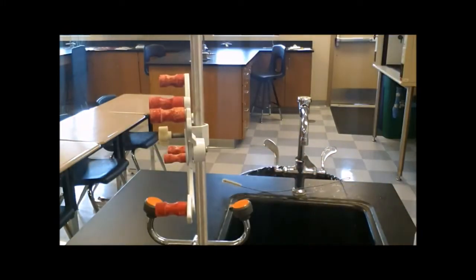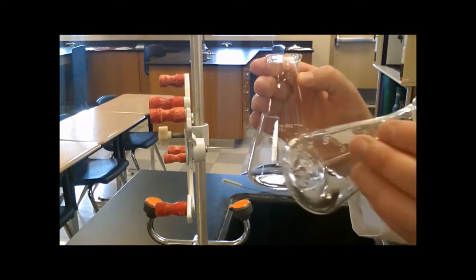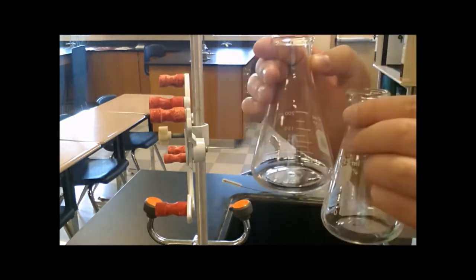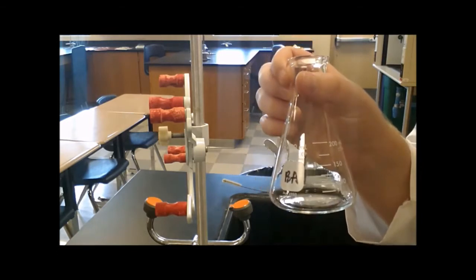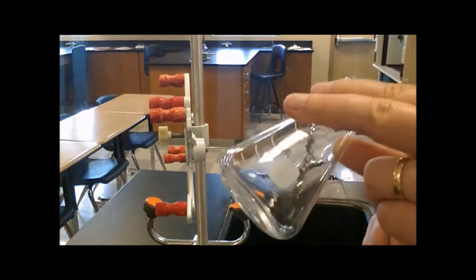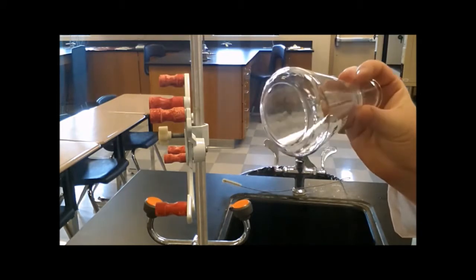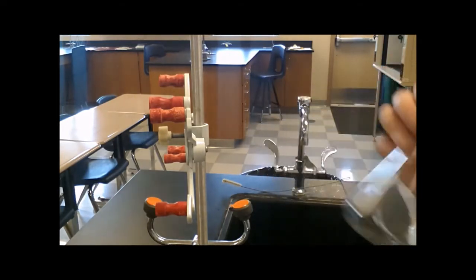You'll need Erlenmeyer flasks, a 250 mL Erlenmeyer flask and a 125 mL Erlenmeyer flask. Which one are you going to use? I would generally go with the 250 mL Erlenmeyer flask, because if you use the smaller flask and you run out of space, you've got to dump it all into a 250 mL Erlenmeyer flask when you could have just started with the 250 mL flask to begin with.